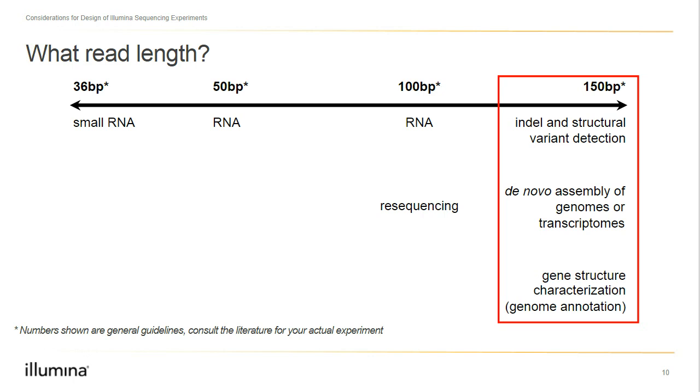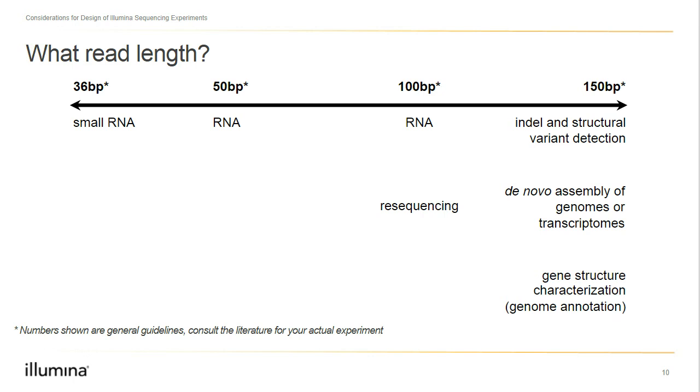Again, these figures are general guidelines meant to acquaint you with when to use certain read lengths. Your scientific journals or papers are your main resource for a particular experiment, and we refer you to those when doing your planning.